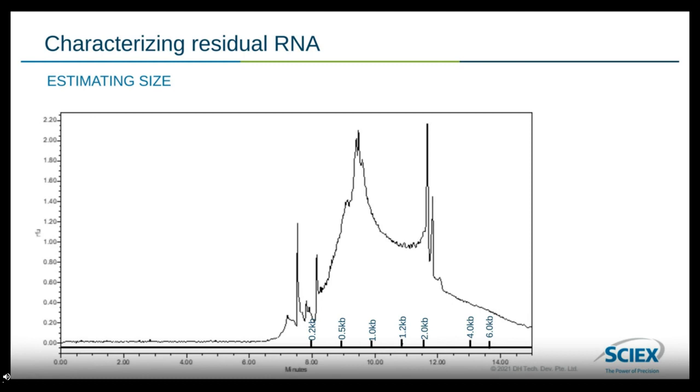We take what we learn and apply it. We increase our sensitivity. We characterize a sample against a size standard, or if it's available, a single RNA fragment. And here in this sample as well, we can see quite a size distribution of RNA.